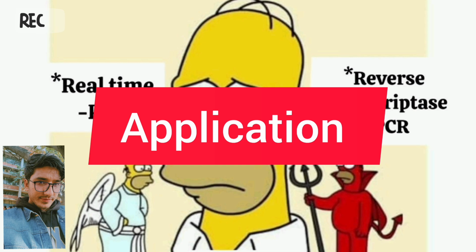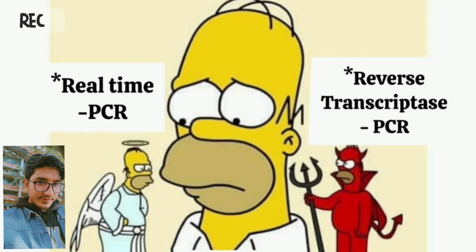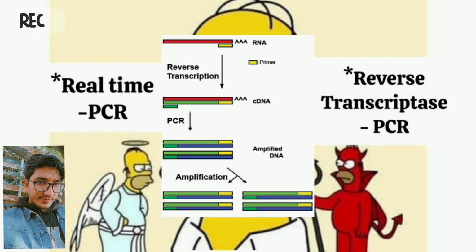So what are the various steps in the reverse transcription step? Real-time PCR does not involve a reverse transcription step; it directly amplifies DNA. But RT-PCR requires an additional reverse transcription step to convert RNA to cDNA before amplification.